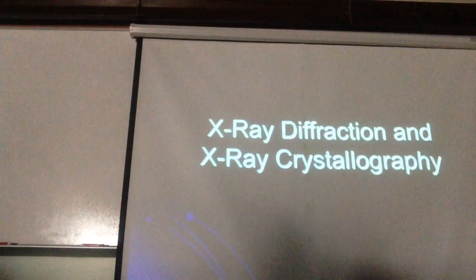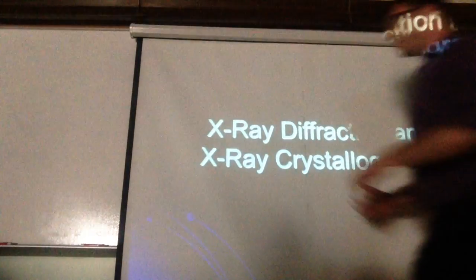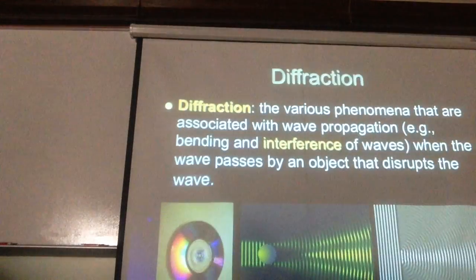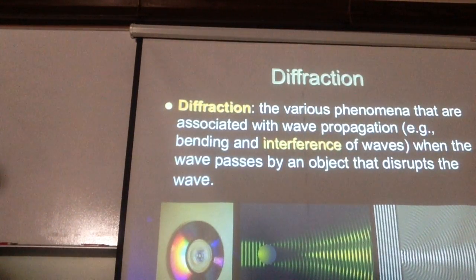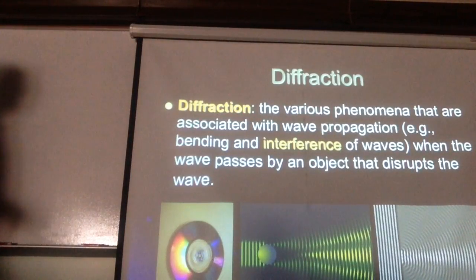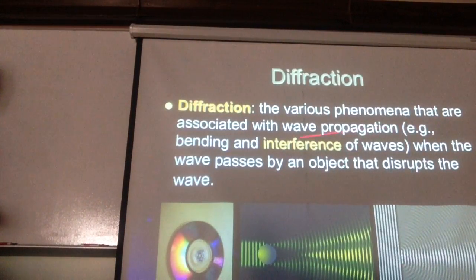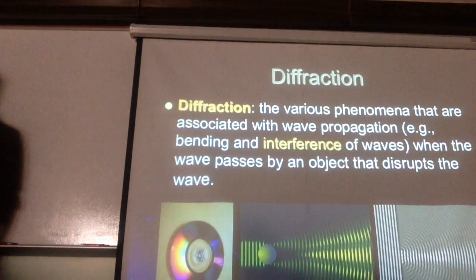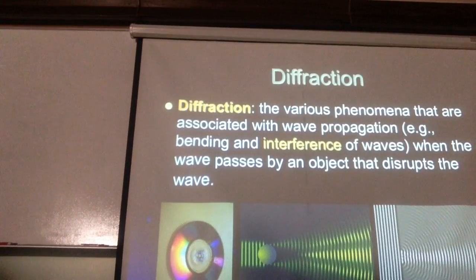Okay. So, X-ray diffraction and X-ray crystallography. Let's start talking about what diffraction is first. Diffraction is the various phenomena that are associated with wave propagation, for example, bending and interference of waves. When the wave passes by an object, that disrupts the wave.